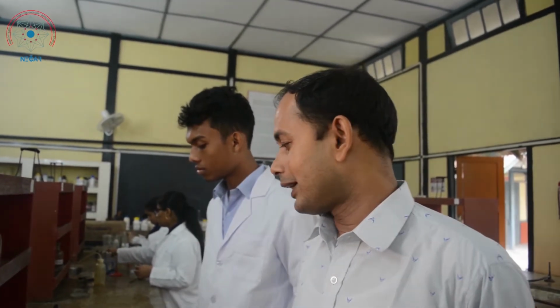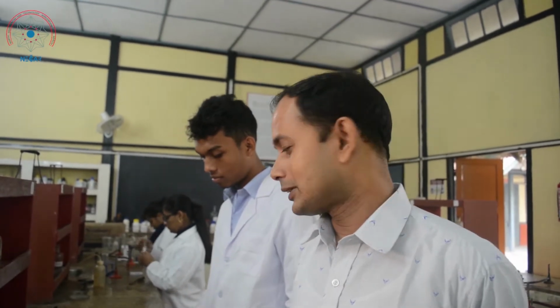So we will be given different types of compounds or salts, and we can analyze by different tests in the chemistry laboratory what the positive ion or basic radical, or the acid radical, is. So now we will follow a systematic procedure through which we can analyze inorganic salts.